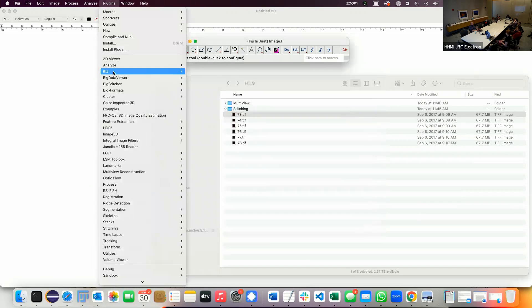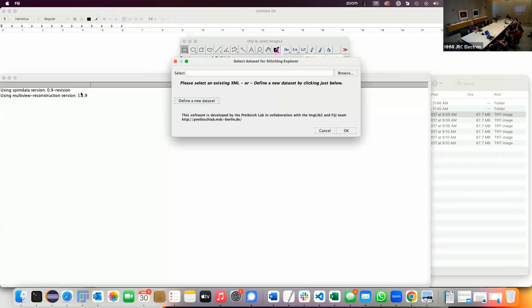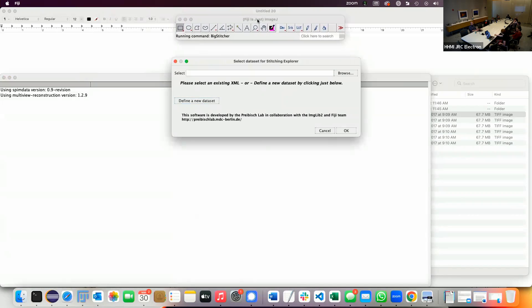Then you go to Plugins > BigStitcher > BigStitcher. In the beginning, we define a project because usually you have many files — or one big file with many different types of tiles and channels. BigStitcher needs to understand these. BigStitcher and Big Data Viewer projects are completely compatible. BigStitcher has a few extra tags: what is the channel, what is the illumination, what is the metadata. Basically we have to define that first, then you can select the project.